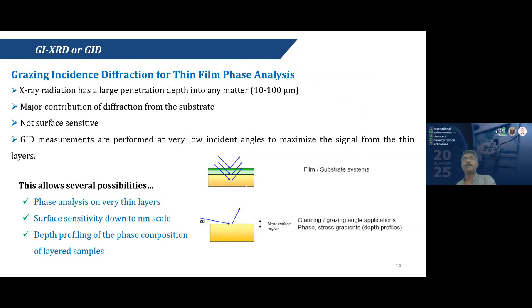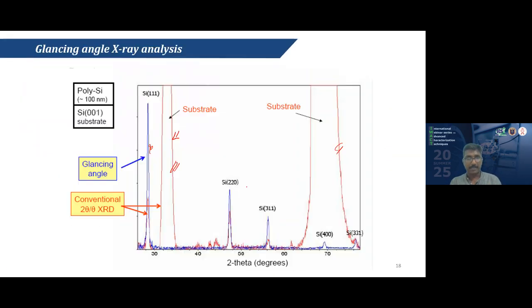In the case of XRD, we can only do some limited scans. Like we can only observe planes that are grown parallel to the sample surface. Whereas HRXRD has high resolution.